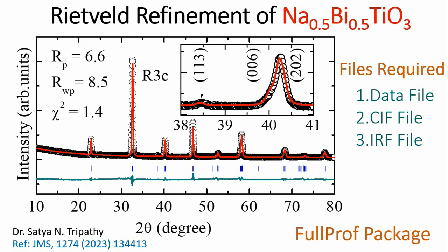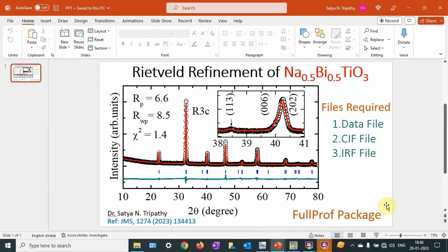I am going to basically use three files: data files, CIF files, and IRF files. The data file is the XRD data you collected in your XRD diffractometer. The CIF file is the crystallographic information file — it is a standard model. The IRF file is the instrumental resolution file, which is basically required for the refinement.